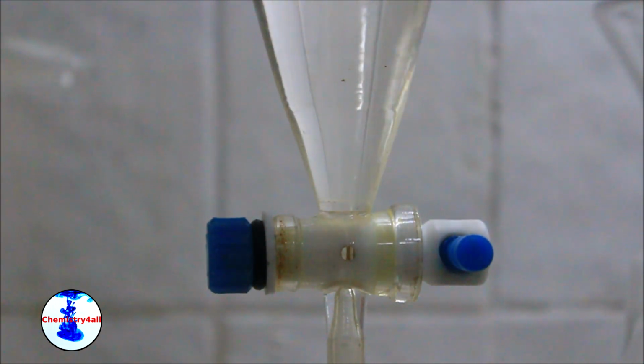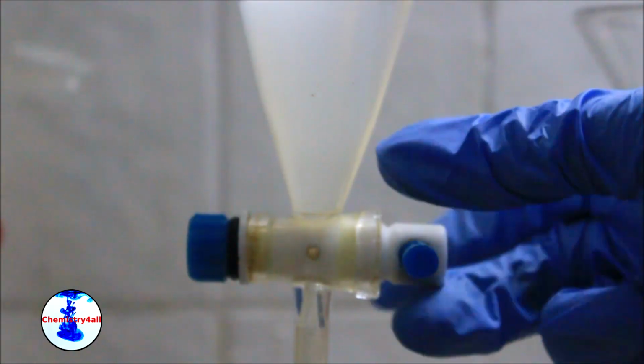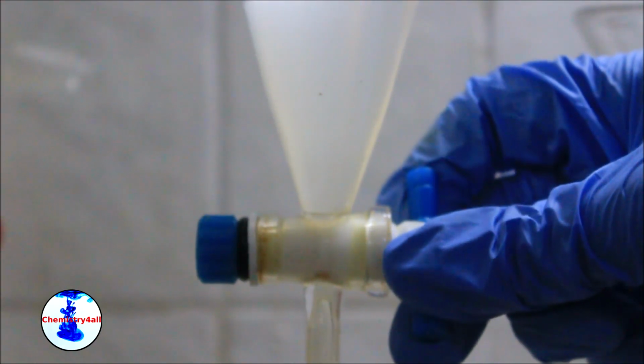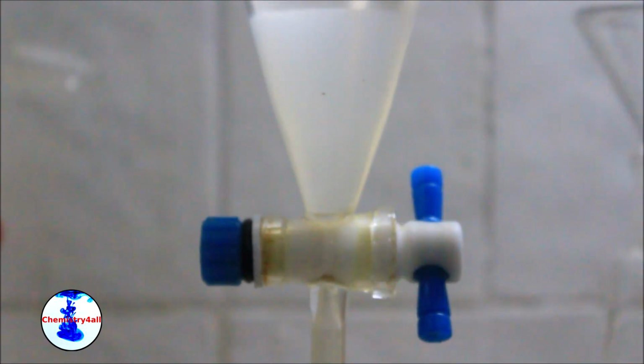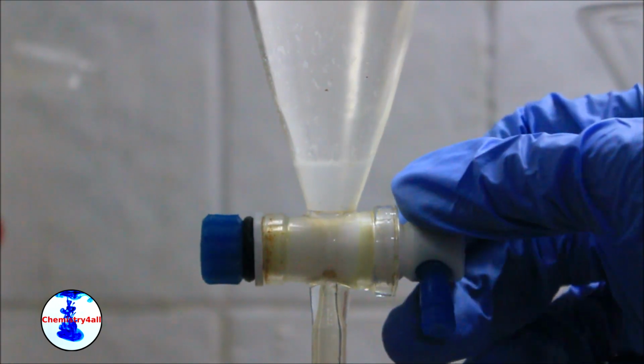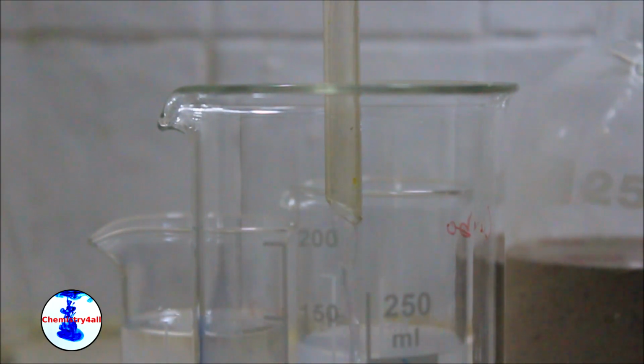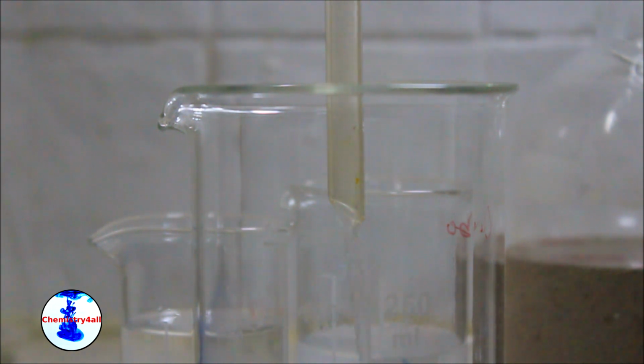The resultant organic phase is then washed with a saturated brine solution. This step should allow us to get rid of any remaining salts and polar species, such as ethanol, from the organic mixture. Once again, the aqueous phase can be then discarded. The resultant organic phase is then collected in a clean and dry beaker equipped with a magnetic stir bar.